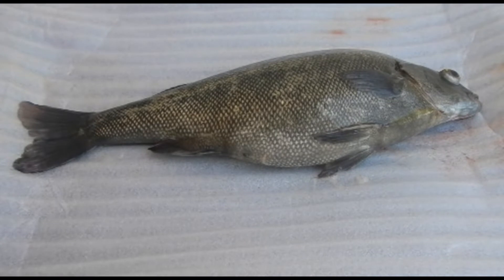Here we've got a cultured silver perch and we're going to begin by describing a bit about some of the anatomy of the fish.